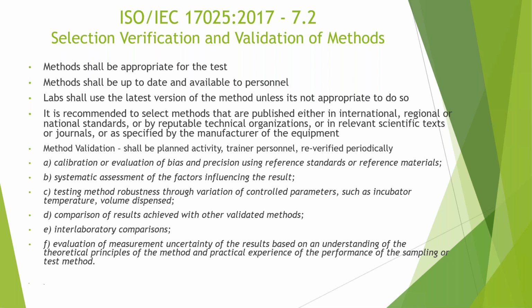When we talk about this topic today, particularly in the cannabis industry, PCR technology has been introduced as an alternative to the plating methods. With that, there's still a lack of validated or nationally known accepted methods for certain things.